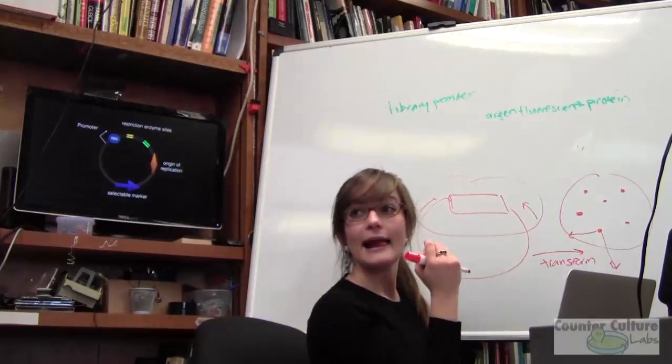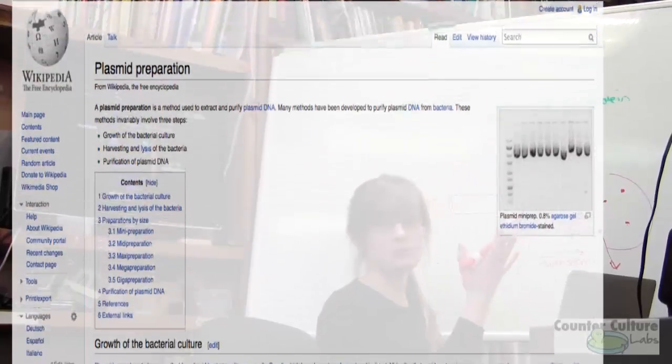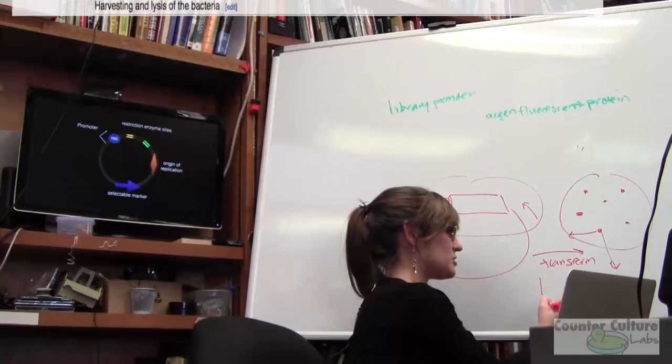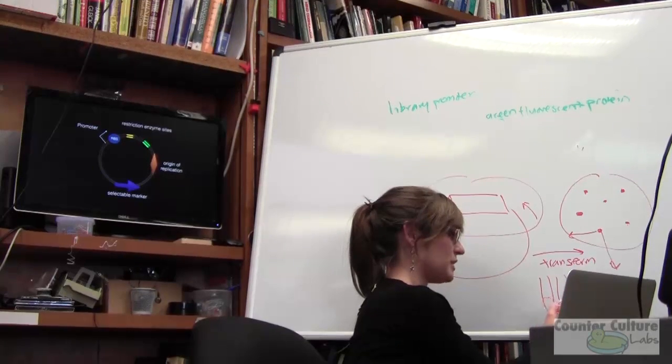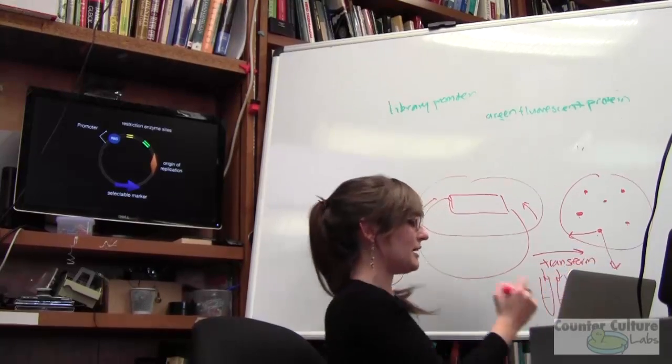I'm not familiar with mini prep. Okay, so a mini prep is a plasmid prep. So you would take your colonies, and what you would do is pick your colonies into tubes or blocks or whatever full of media. So you take some of this and put it in here, and that and there.